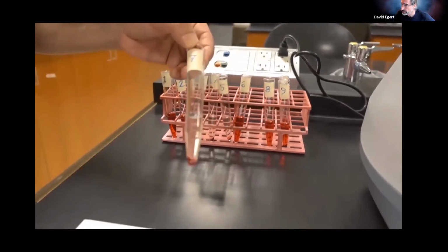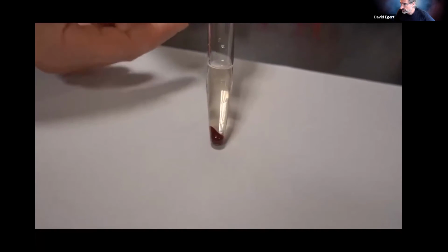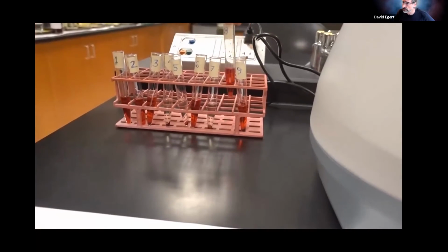Test tube 7 is going to be the 0.3 molar, which is also 0.3 osmolar sucrose. And we can see a really nice well-formed pellet with a relatively clear supernatant. Here we have the urea, and we can see the urea also has a red supernatant and really no pellet. So we're assuming here most of the cells popped.